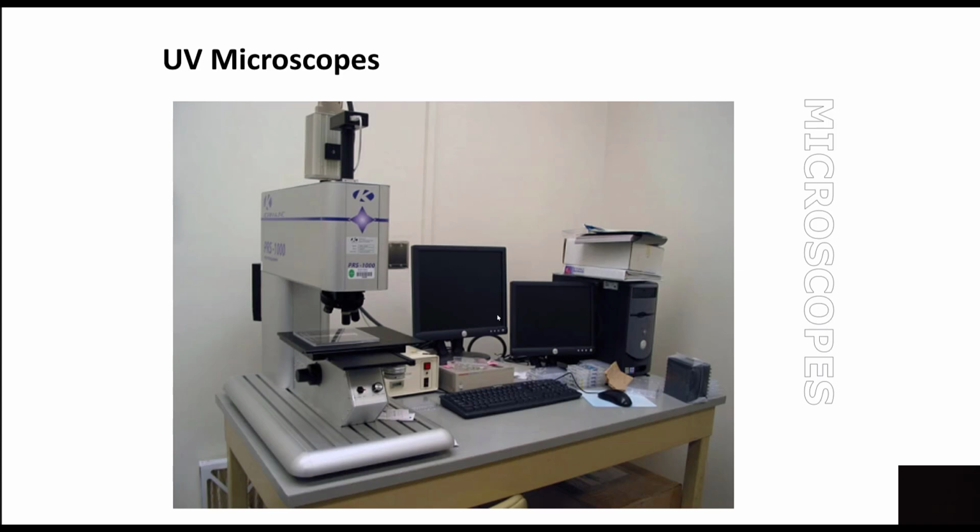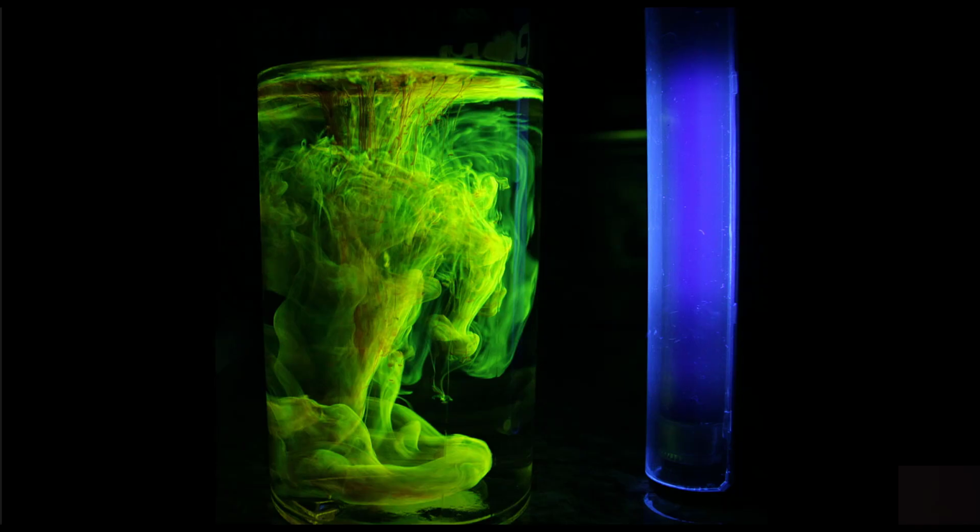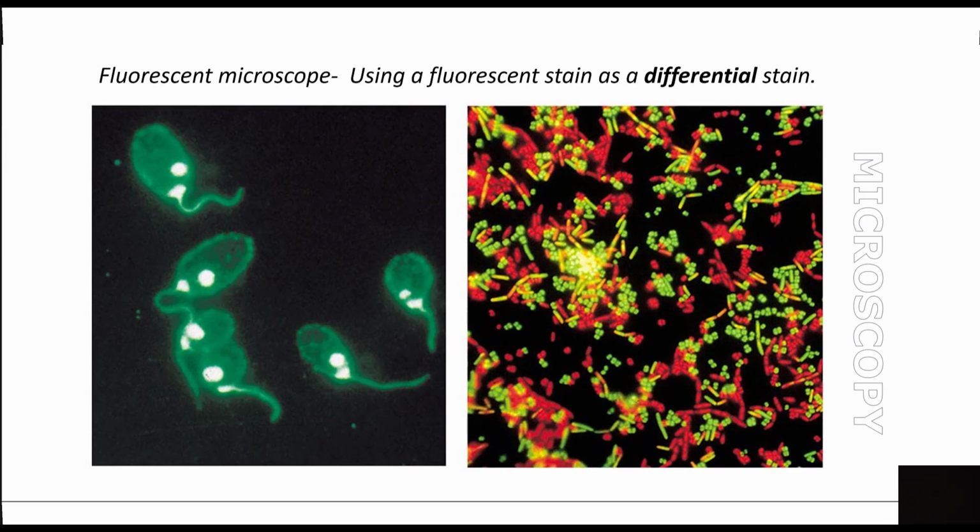Here's a simple scope that we used at the vet school. It had the post-processing and various things that we could do, but it's a very nice scope. They tend to be a little expensive. We're talking $200,000 to $300,000, and again, what we're doing is taking advantage of that dye that under UV, just like walking into those types of stores where they have black lights and things just kind of pop out of your clothes in terms of white or whatever.